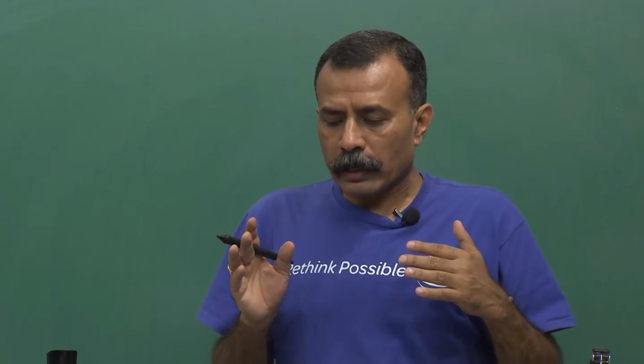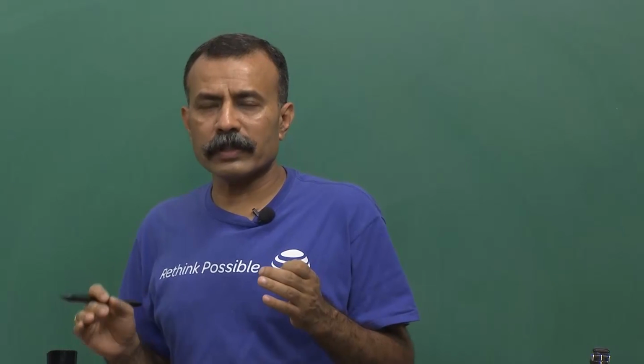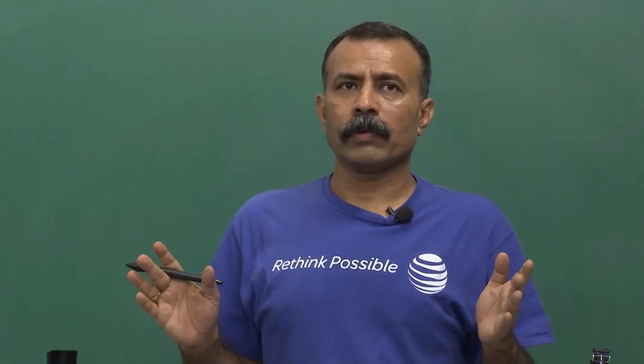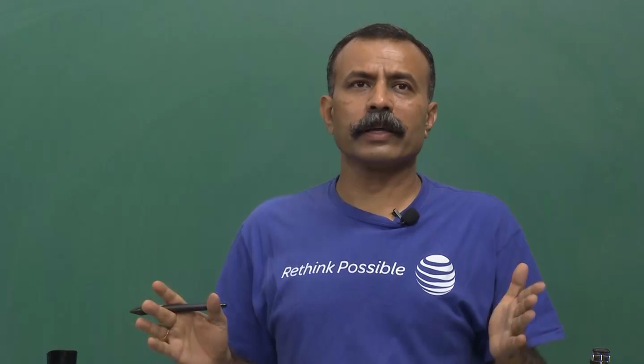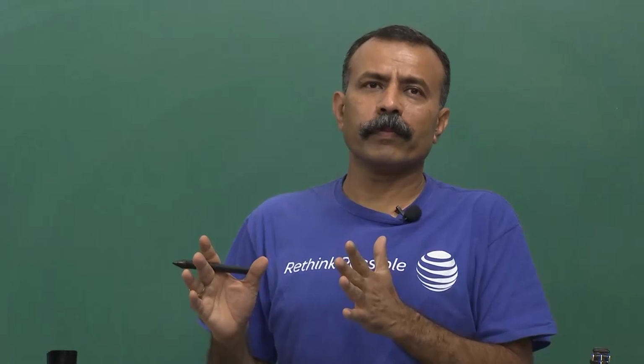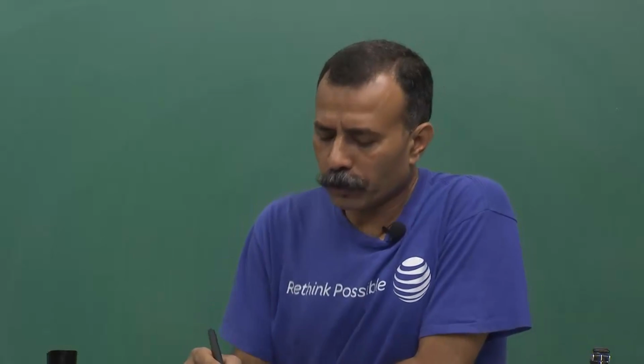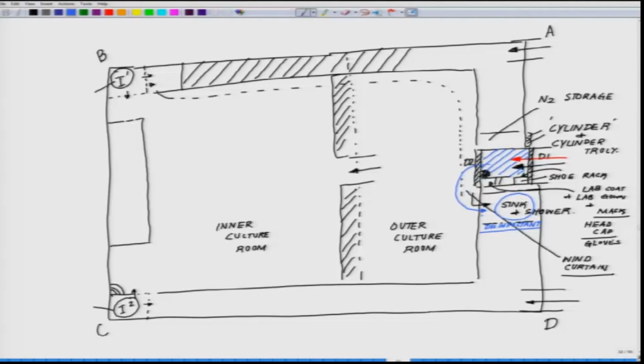Okay. Apart from it, the personal hygiene is very important. Just ensure that you have taken necessary care about yourself, because we, the workers, are the major source of contamination into the system. Okay. So, this is where you have the disinfectant and everything.